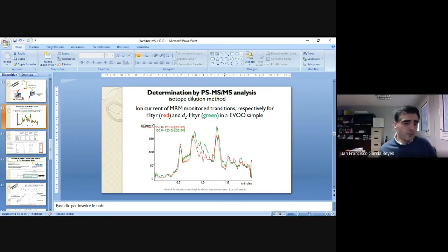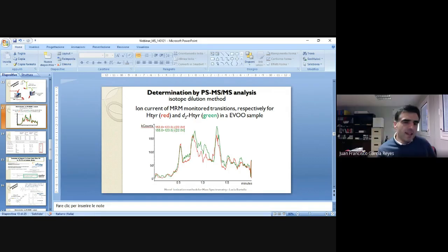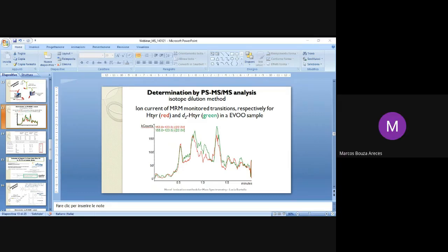This is quite a lot. Probably, if you spot maybe 2 microliters, then the signals should be short. Yes. But then you may have the problem that the sample may stick to the paper and you won't see it. So this is something you need to optimize for each particular application, I guess. Okay, thank you very much.